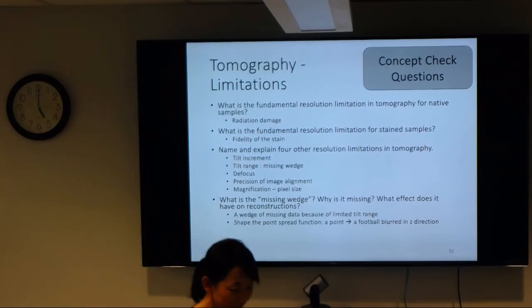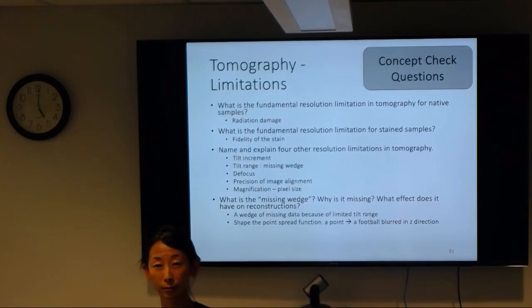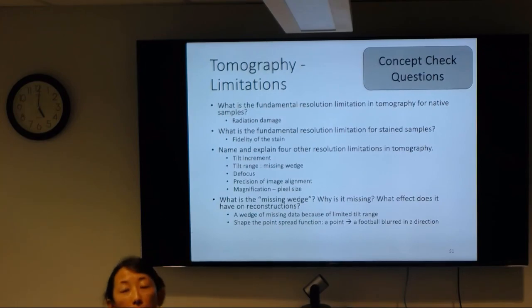Okay. So for the students, Micah, do you want to talk about the practical? We have our first practical on Wednesday. This is our microscopy practical. We are going to go over a fast version of the alignment of our T12 microscope, our 120 kV screening scope right over here. We're going to meet here at 3:30, same time as the normal lecture. Then we'll head over to the microscope room and look at aligning the gun and the condenser system. For the students taking it for credit, there will be a small worksheet that you have to fill out and turn in the next week.